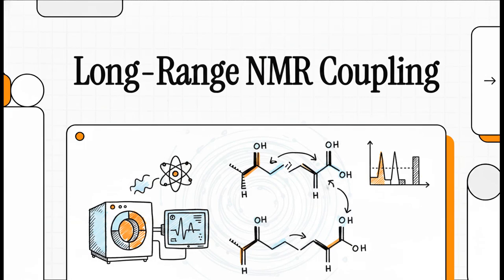Okay, so if you've spent literally any time looking at NMR spectra, you already know the absolute basics of spin-spin splitting. But today, we are pushing way past those standard boundaries. We're going to explore long-range coupling, specifically how allylic, homoallylic, and homopropargylic interactions actually work in the real world.